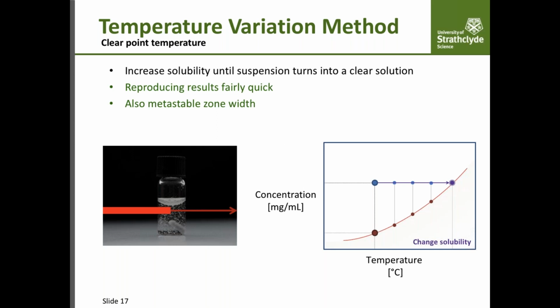So we can do a lot of measurements in this way, and there's commercial equipment available to do that in quite a standard way already. And you can also obtain, say, kinetics of the process by cooling down and crystallizing out. You can determine the kinetics of the crystallization process.